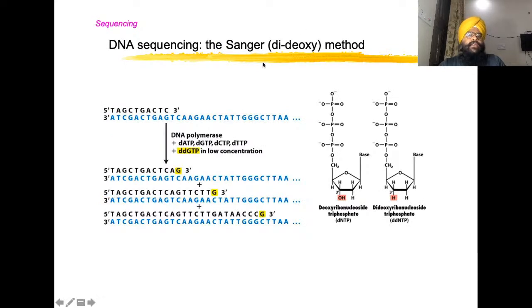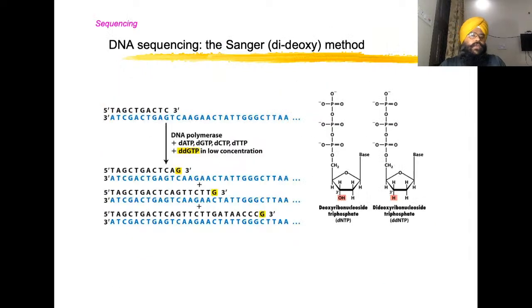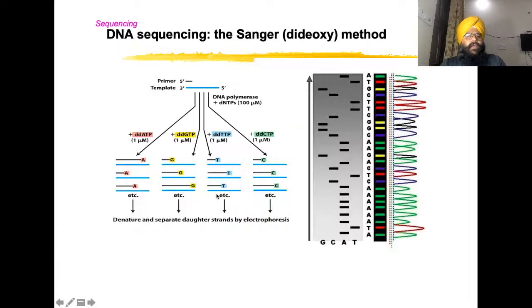The DNA sequencing has the Sanger dideoxy method. Now we have discussed cloning so far; now we are talking about sequencing, which is the new part. Sanger is the one who won the Nobel Prize for the method that he identified. So you have your known sequence, and you want to check which sequence is present. You add DNA polymerase, dATPs, dGTPs, dCTPs, dTTPs, and ddGTP in low concentration. Then the one corresponding to your sequence will start moving ahead, and it will stop at the G. Where it is stopping, we can recognize that sequence.